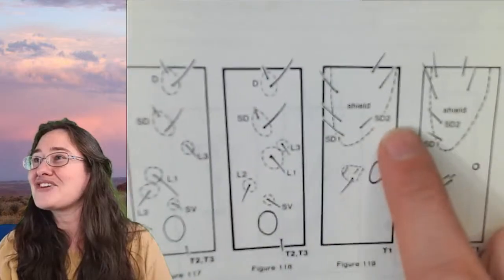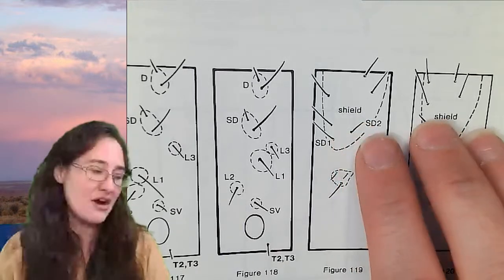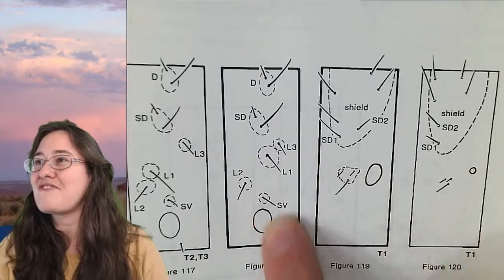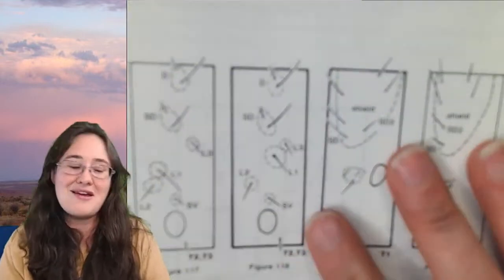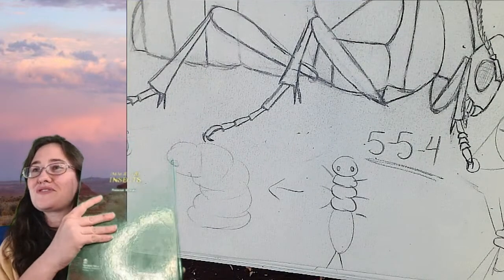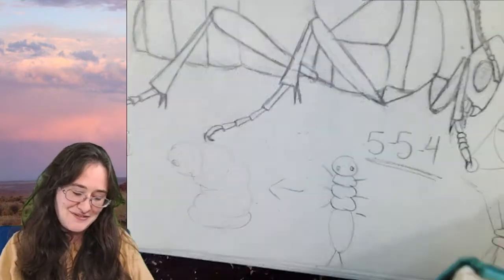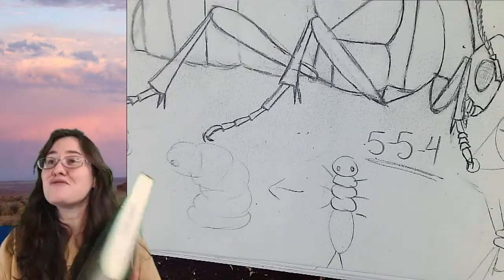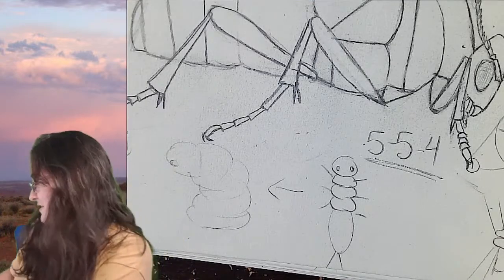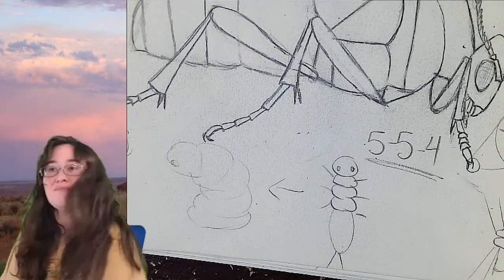But yeah, you're using these shields that are sclerotized, or hardened, areas of their exoskeleton. And then you have dorsal, subdorsal, lateral, subventral, and ventral. They kind of just divide it out and then number them. And yeah, that's a fun time. And maybe one day we'll go through, oh, the book is green, so it's totally see-through. Maybe one day we will go through and identify that. And the guy who wrote this book, Fred Stare, we used to have lunch regularly together, so he signed both of these books for me. We used to work in the same museum.